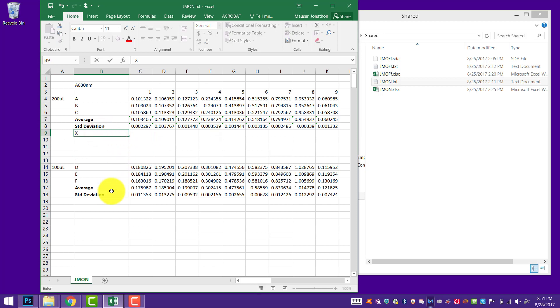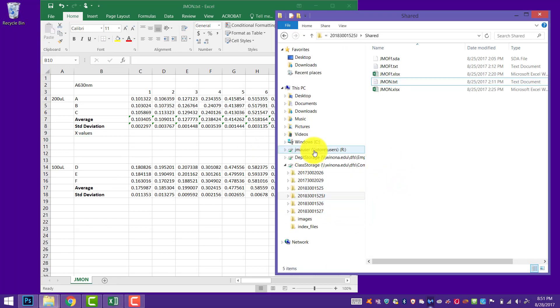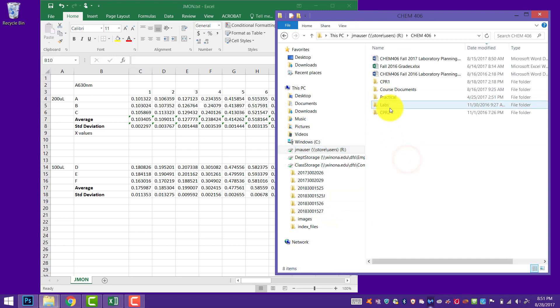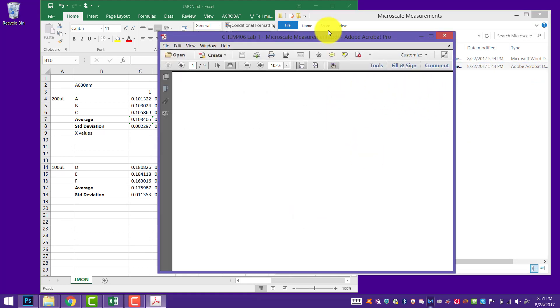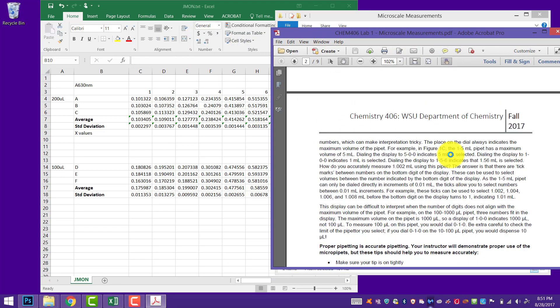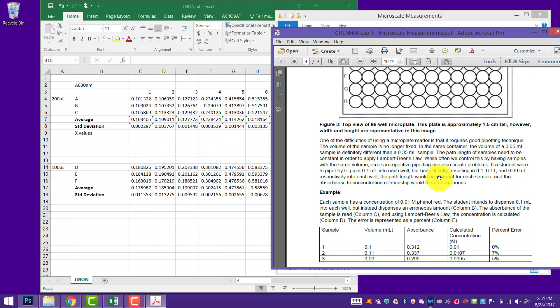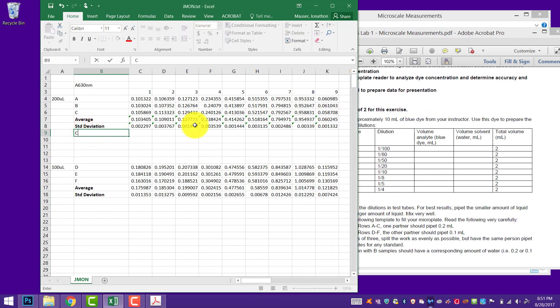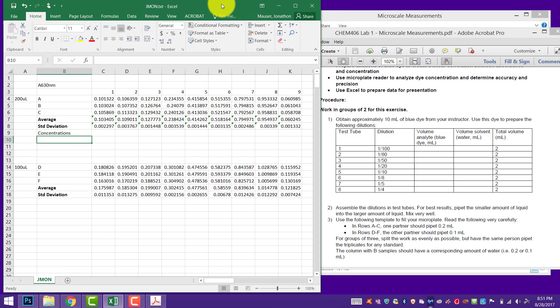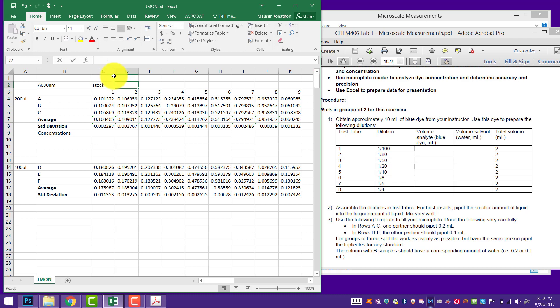Another thing I like to do is put the X values in. I'll look at our protocol — I have my Microscale Measurements Lab open. I need to figure out my X values. My X values in this case are my concentrations. Remember that our stock solution was 0.2% volume to volume, so my stock concentration is 0.2%.